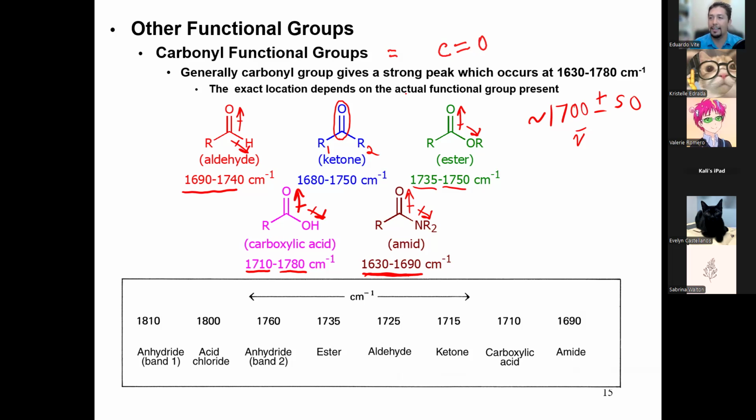So again, think of it like a last name. Like, well, who are you? I am a carbonyl of a carboxylic acid. Who are you? I am a carbonyl of an ester. I am a carbonyl of an amide. You have to talk like that. When I tell you be specific, if you don't talk to me like that, I'm not going to have any idea what you're saying because there are other groups here. Are you talking about the OH of the carboxylic acid? Are you talking about the CH of the aldehyde? Be very specific with your words. And so we're going to go through some examples right now of different types of carbonyls in different functional groups. But are we okay with the distinction between functional groups and the carbonyl?